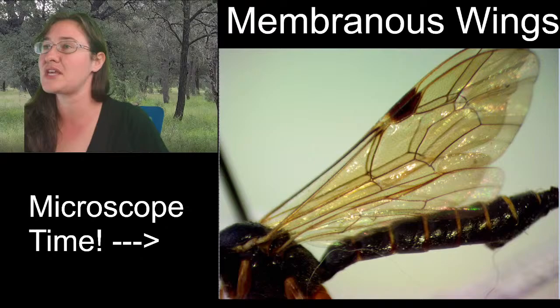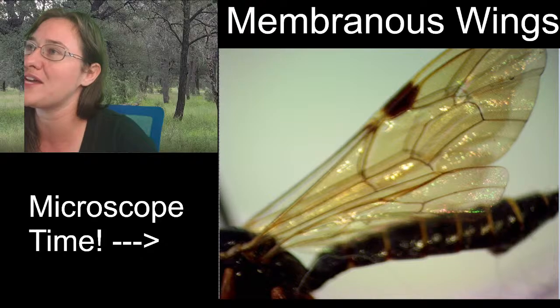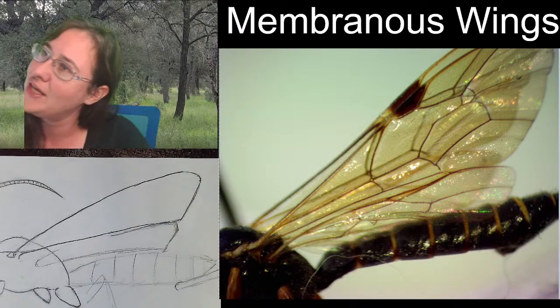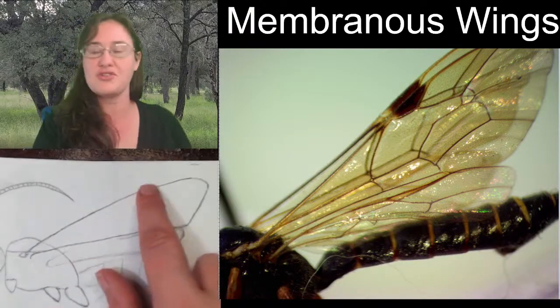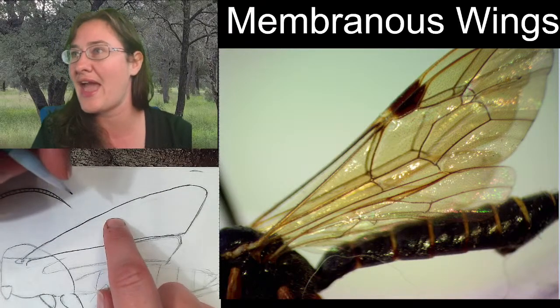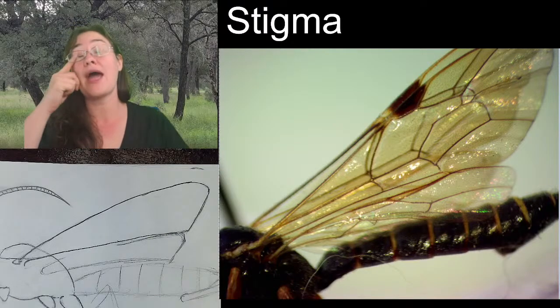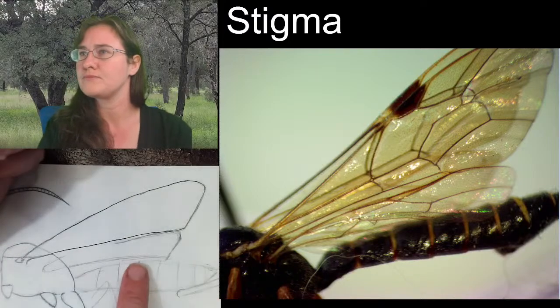Now, there are wing venations in these wings that are important. Although because the wings are see-through, you might get tricked by some of the veins. So we're going to sketch out the wing veins together, because I want to make sure that we know what's happening. Our first vein all the way up here at the top, we call the costa, the costal vein, C-O-S-T-A-L. And once you get to that darker spot, we call it the stigma. And I believe that there are also stigma in dragonfly wings. I believe that's the case.